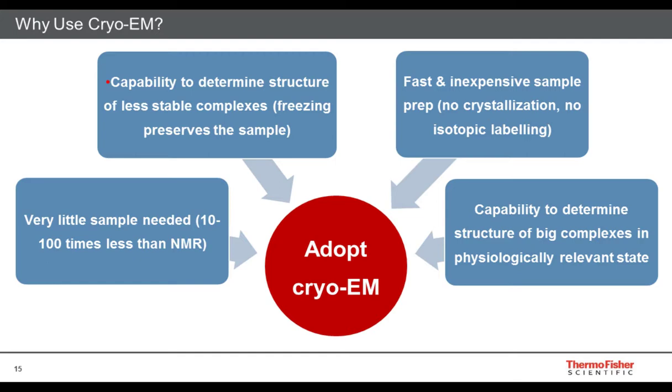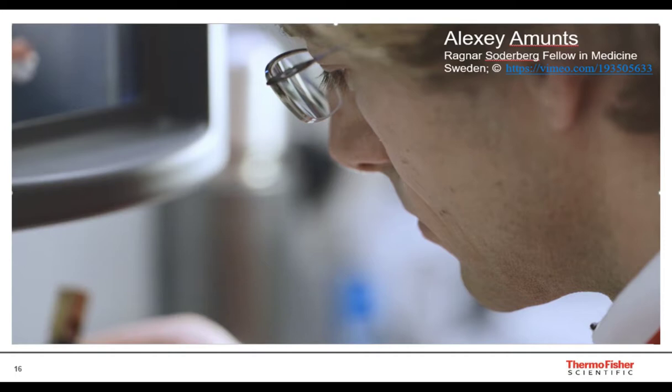So it's a little bit easier on paper at least, because you miss part of the complex crystallization and labeling process. And in general, you need only very little, little aliquots of material. So a few microliters, actually even nanoliters of suspension are in principle already enough to perform Cryo-EM. That makes it actually very, very attractive.